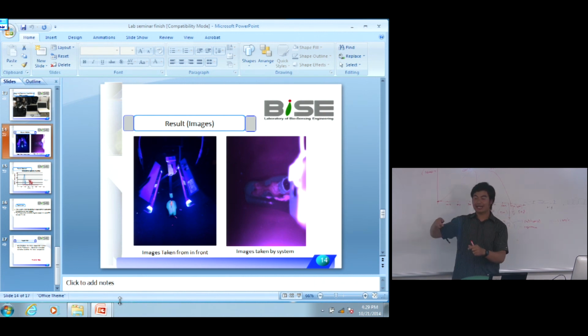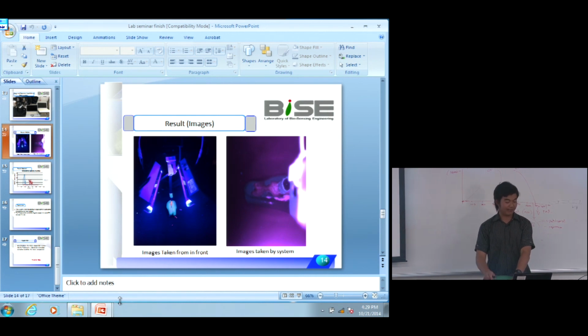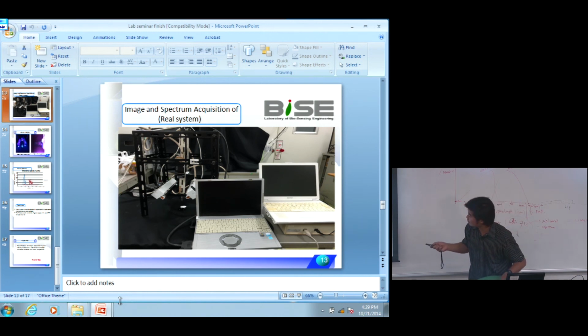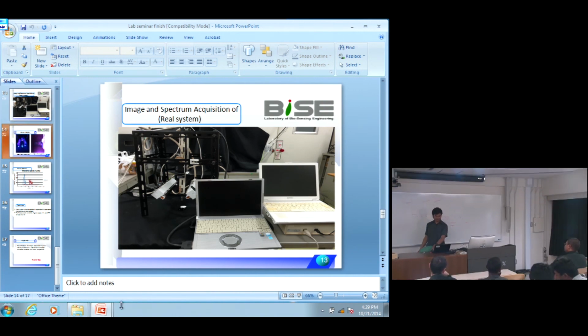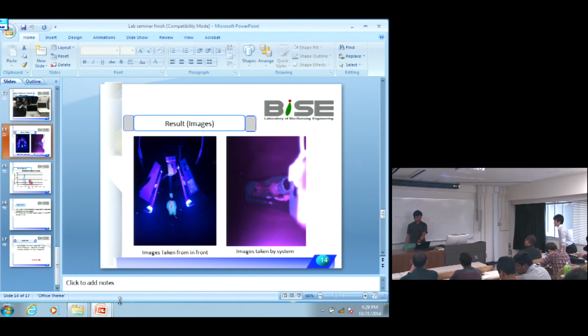Yes, it has fluorescence, like a plastic. I use plastic to hold the optical fiber like this. Okay, please try to take a clear image, not only UV image, but also the visible image.